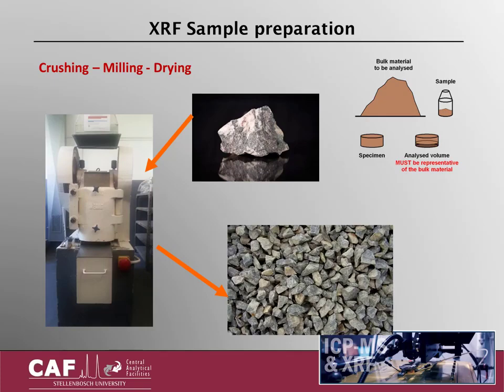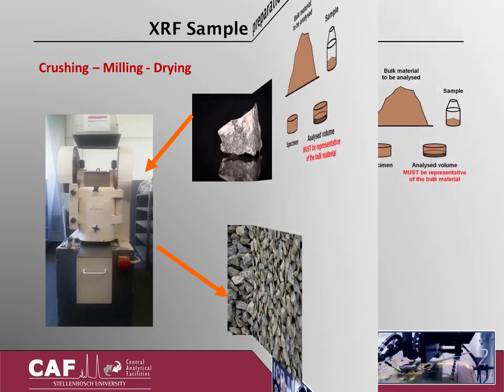During field work, a bulk sample will be collected from the outcrop. Selected fresh rock pieces, meaning unweathered pieces, are placed in a jaw crusher to crush the sample between 1 to 2 cm rock chips. A rigorous cleaning method of the crusher is done before and after crushing to avoid any contamination. The jaw crusher works well for rather large sample volumes of about 1 to 2 kilograms. Smaller samples can be broken down into pieces by a hand crush or hammer.